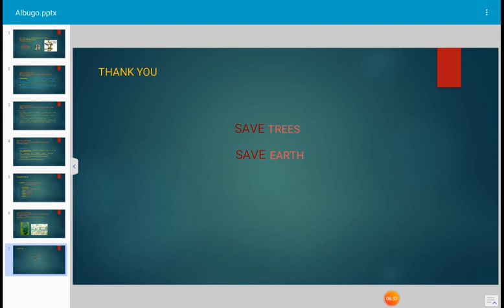This is a practical of undergraduate level, and this you have to perform.